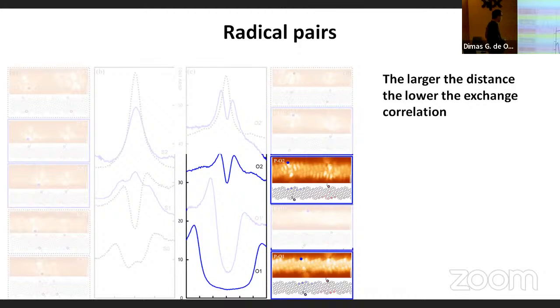Now, let me first explain what these spectra actually represent. Here we see these steppy structures, and these steps come from an increase in the conductance. It comes from the fact that at these energies, you are allowing the electrons to flip. By doing that, you're opening additional possible conductance channels, and then your measured conductance increases. So the energy at which this happens gives you an idea of the energy that you need to flip those electrons.